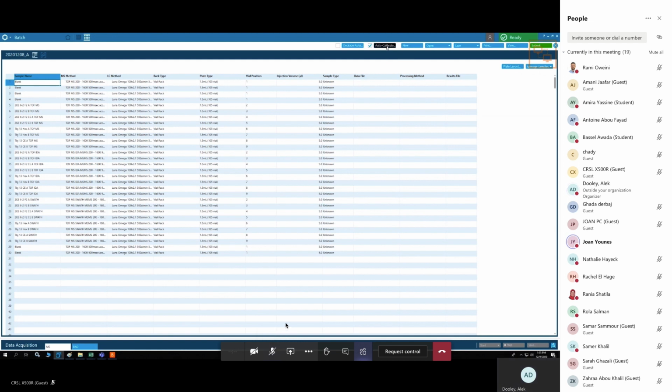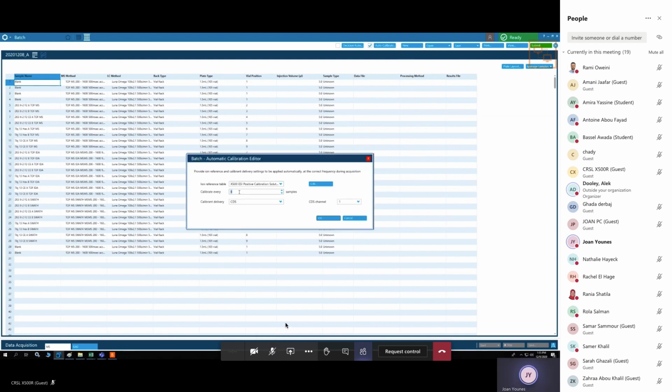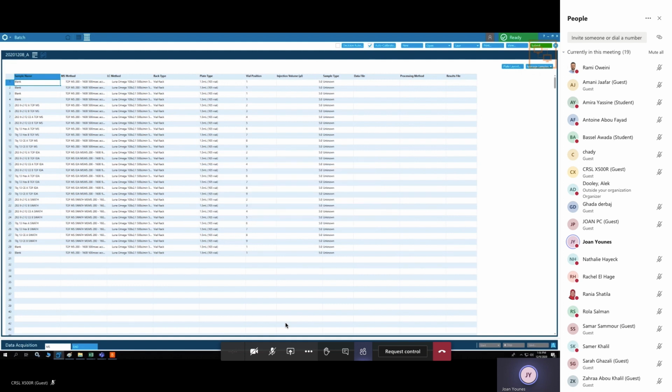Okay, I have a question. If after submitting a batch, we want to add to the batch 2 or 3 other samples, we forgot to add them, so if we add them to the batch, and we submit once again, it will be added to the same queue? Correct.